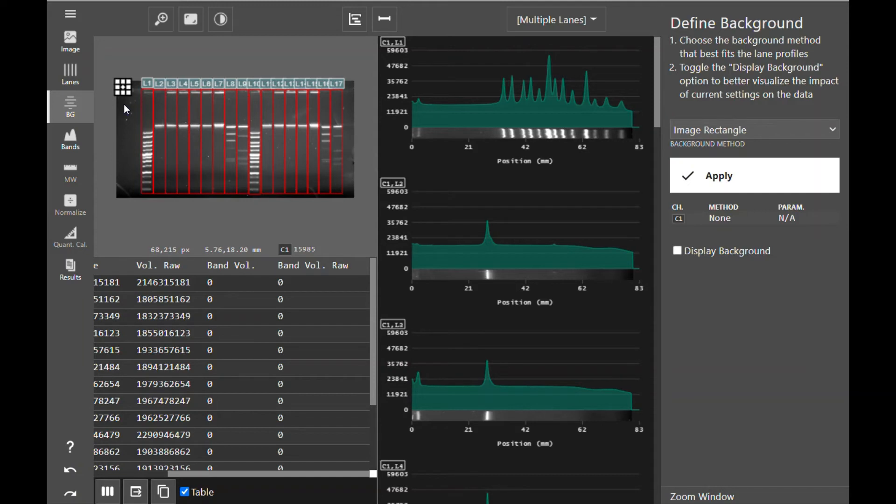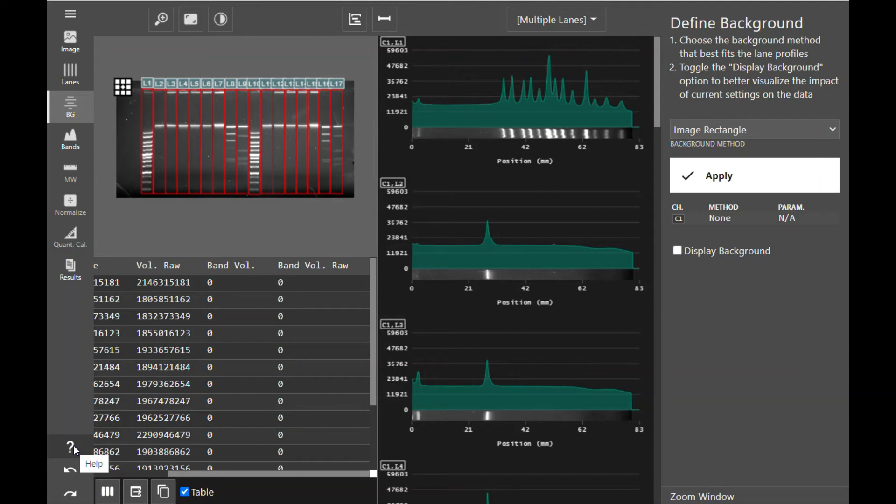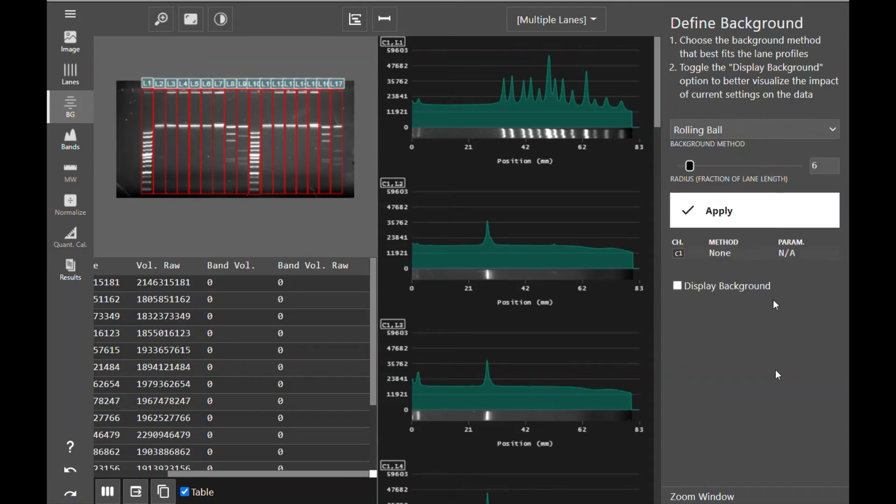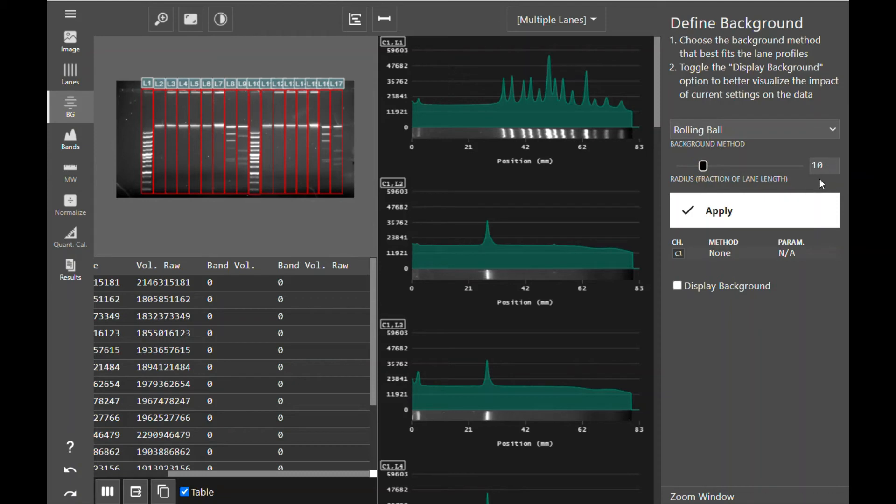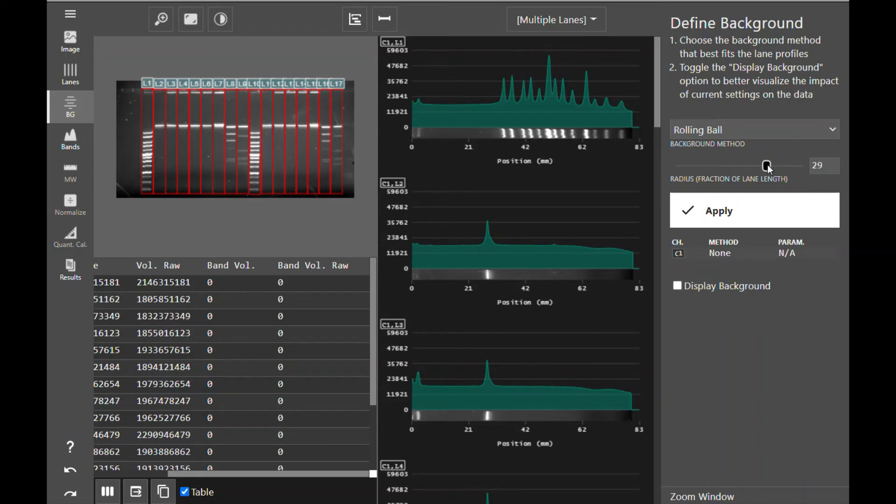If you need more explanation on the different background types or more information about background subtraction, click the help button to open the background definition section of the Azure Spot Pro manual. For this image, I'm going to use rolling ball as my background subtraction method. With rolling ball, you can adjust the radius of the ball with this slider or by entering a number here. The radius number displayed is actually a fraction of the lane length. So a larger number is going to be a smaller ball because it is a smaller fraction of the lane length, whereas a smaller number is going to be a larger ball because it is a larger fraction of the lane length.